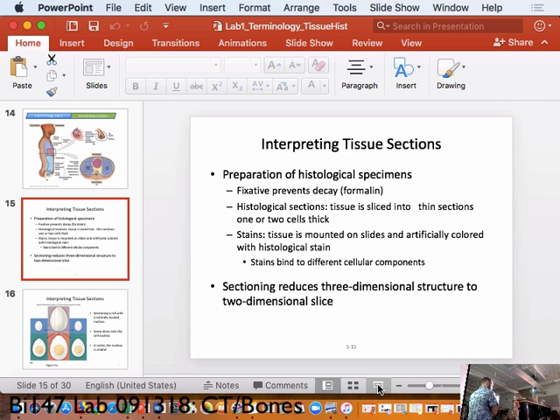Now, the easy part, let's turn the microscope on. There's a little switch on the side someplace. To use the microscope correctly, you're going to have to get the eyepieces to match your eyes, and they can bend so to be near or further. It helps to get your chair to the right height, so you're not craning your neck or whatever. There's a little bar under your chair on the right-hand side, a handle. If you stand up and you pull it up, it'll make the chair go up. All right, next.